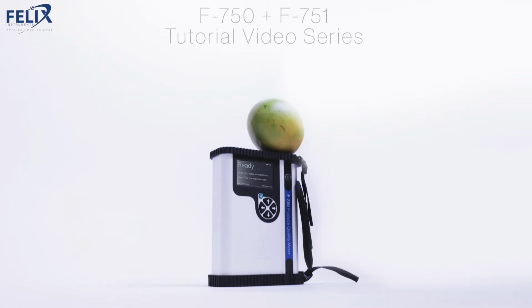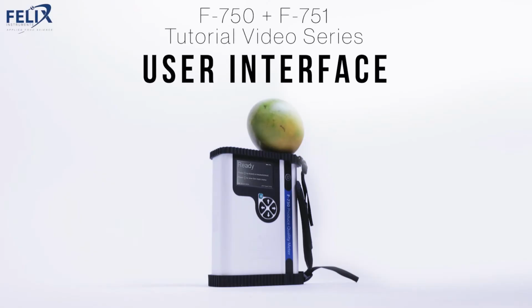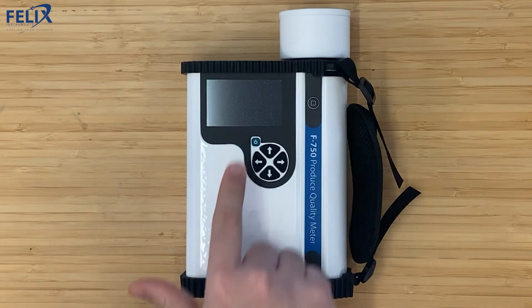Today I want to demonstrate how to navigate through the various menus with the new firmware update for the F-750. We'll start by powering the instrument on by clicking the power button.